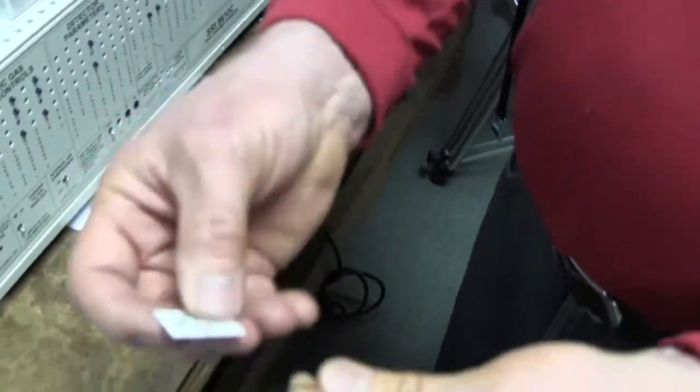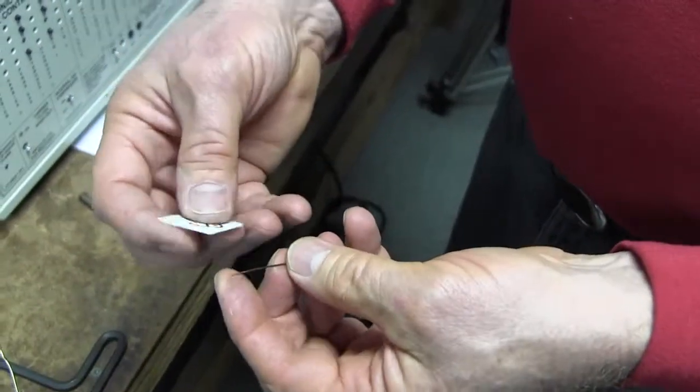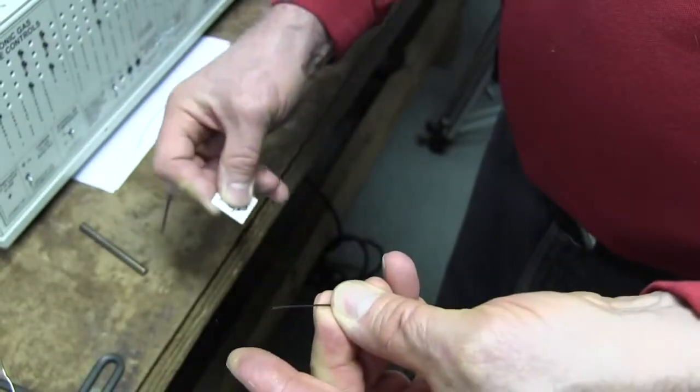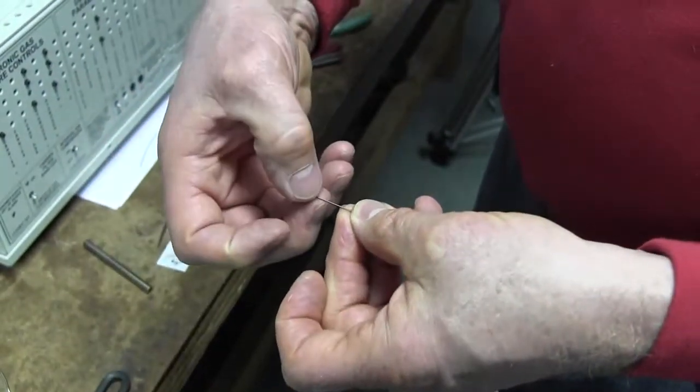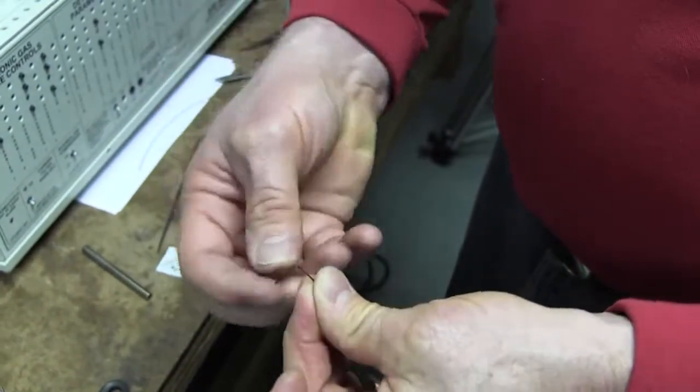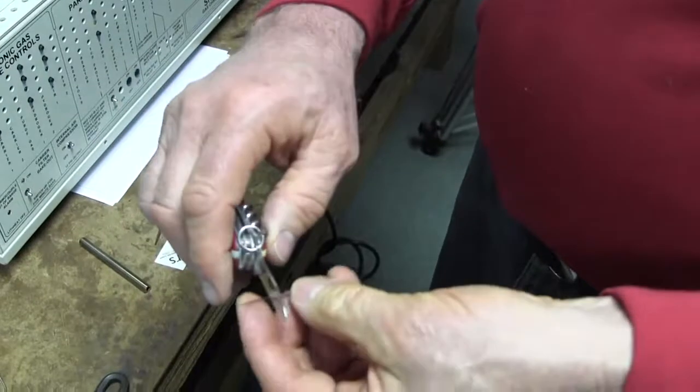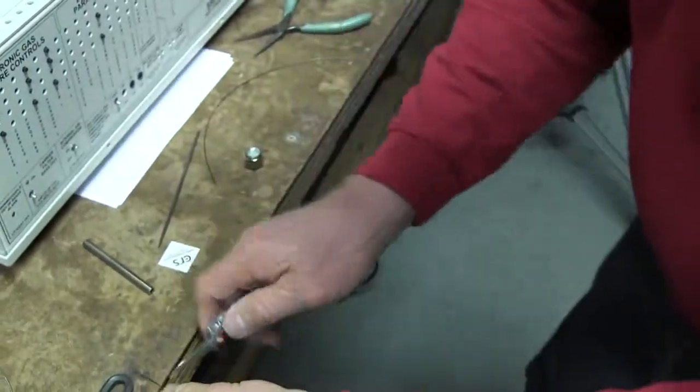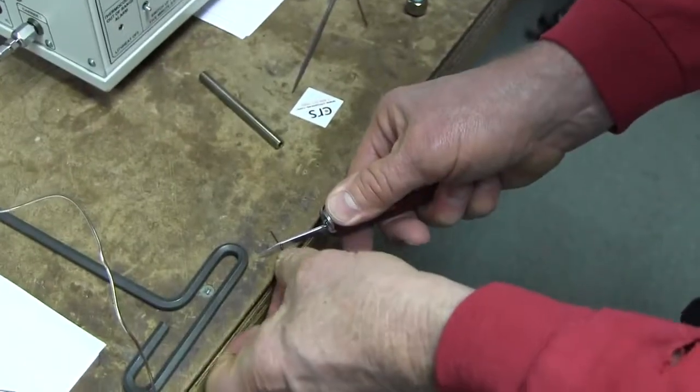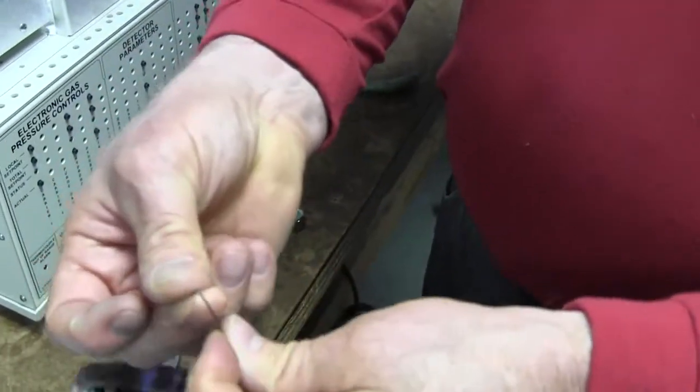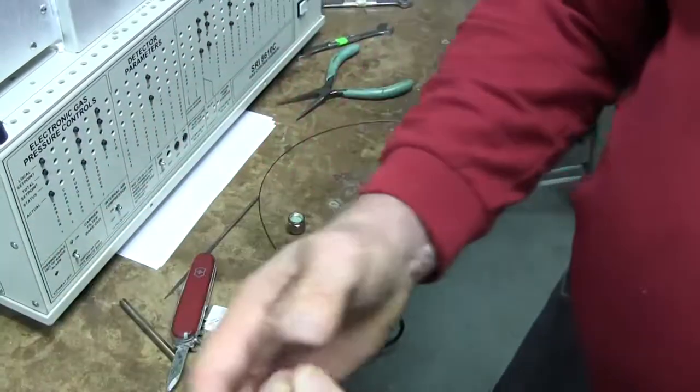There's also a tool called a ceramic scoring wafer. It does basically the same job. You use the hard edge of the ceramic to put a little nick into the column and then break the column over your fingernail. In a pinch you can use a Swiss Army knife. Be careful not to cut yourself. Put a little nick in the column and then break the column over the nick.